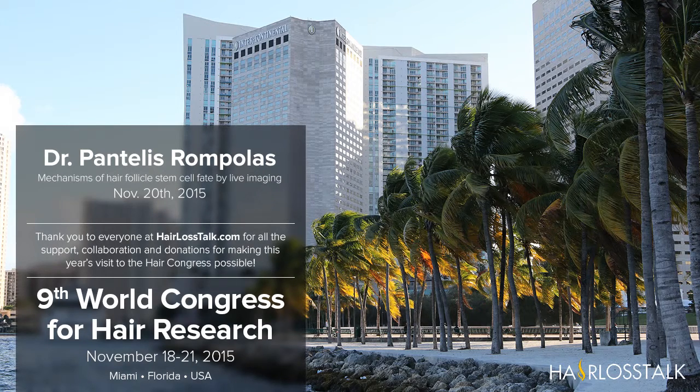The direction we took to address this challenge is to adopt a live imaging approach. The question we posed was rather simple: can we visualize the entire process of hair regeneration in the live intact skin? For that, we put together a live imaging system where we can visualize stem cells and other cell populations in the intact skin of live mice. And I have to stress that all the data that I'm going to present from now on were acquired from imaging live anesthetized mice, from the intact skin.